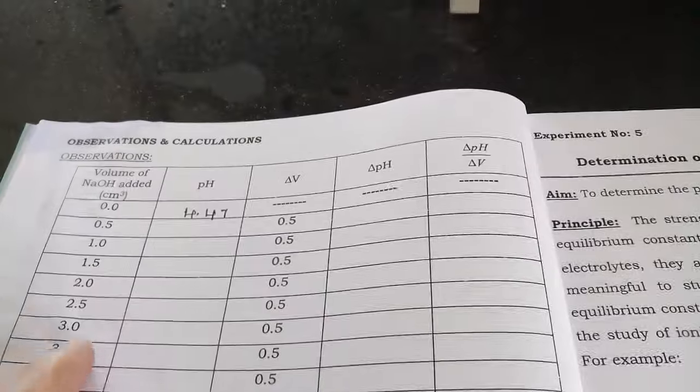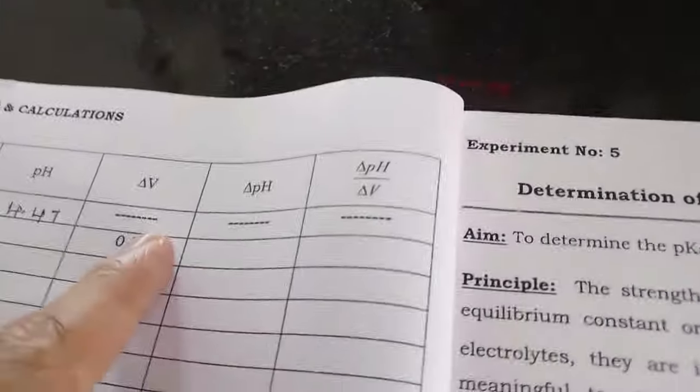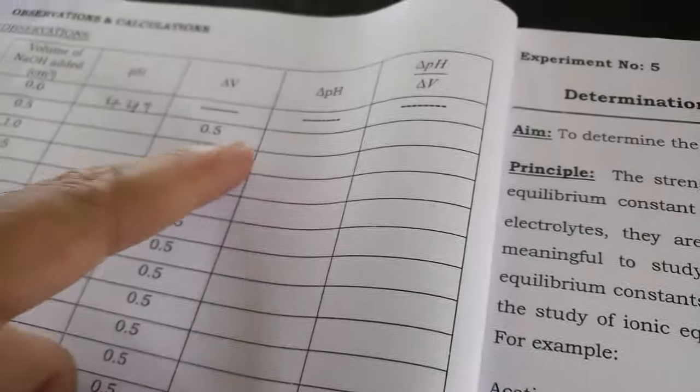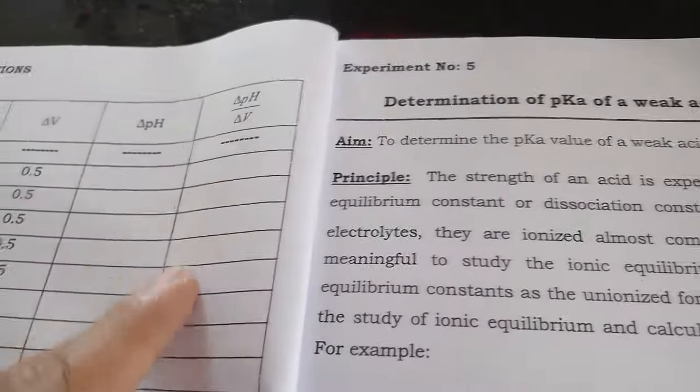So here we have volume of NaOH added in cm³, pH, delta V, delta V is nothing but the change in volume of NaOH that is 0.5, delta pH, change in pH, delta pH by delta V. Based on this we are going to plot the graph.